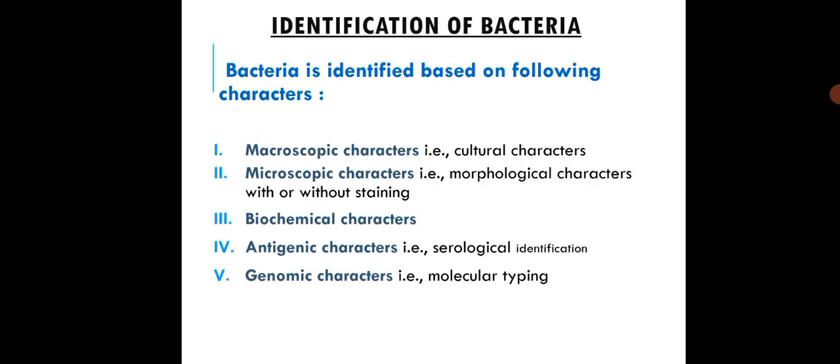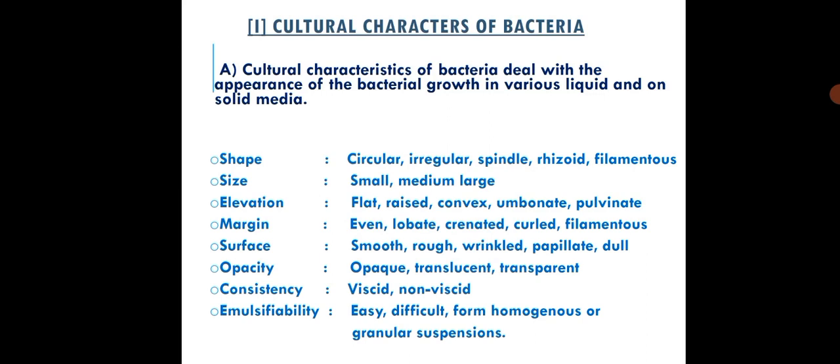In this presentation, we are going to cover first two topics of cultural characters and microscopic characters for identification of bacteria. Cultural characters of bacteria. The cultural characteristics of bacteria deal with the appearance of bacterial growth in various liquid and on solid media. It includes shape that can be circular, irregular, spindle, rhizoid, and filamentous.